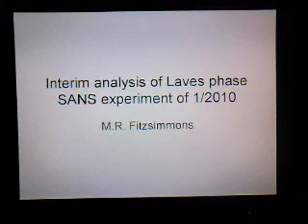So I'm going to discuss here the analysis that we have so far of our Laves phase experiment done at the SANS instrument, NIST, January 2010. And in attendance of the experiment were Julie, Sandra, Catherine, Mark, and Mike.